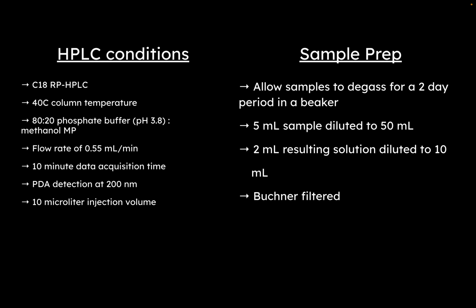And for sample prep, all you have to do is degas it for 2 days. We'll get to a different method that I found a little later. They do sonicate it, but at the time that I was developing this method, we were just going to allow them to degas by open beaker. I didn't know we had a sonicator basically, because someone was being a little dumb.